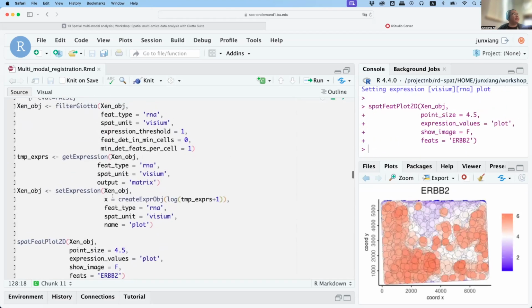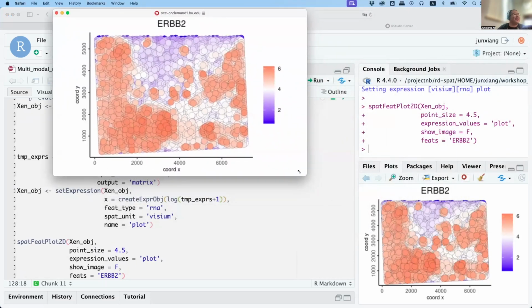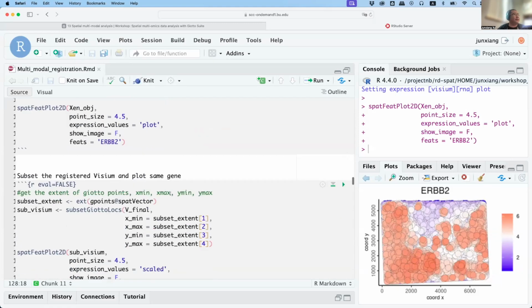And this getter and setter functions is just me trying to find a better color scheme. And yes, this is what you will see from the expression pattern of pseudo VZM.